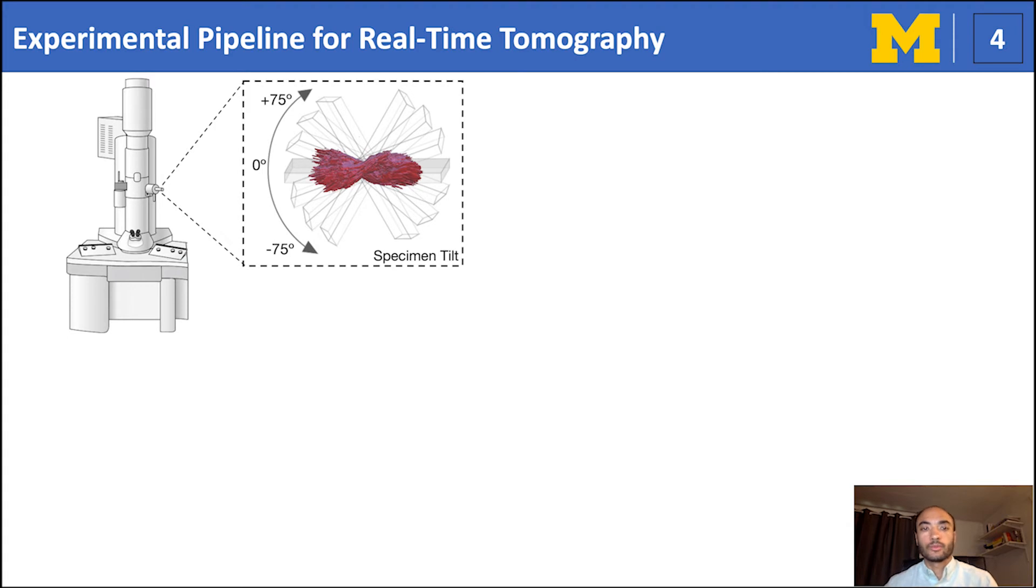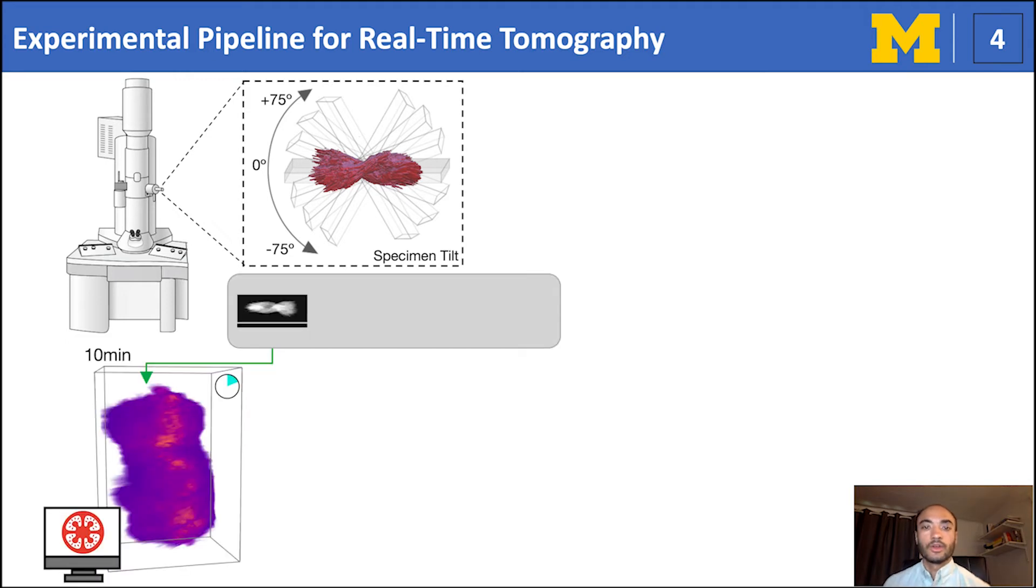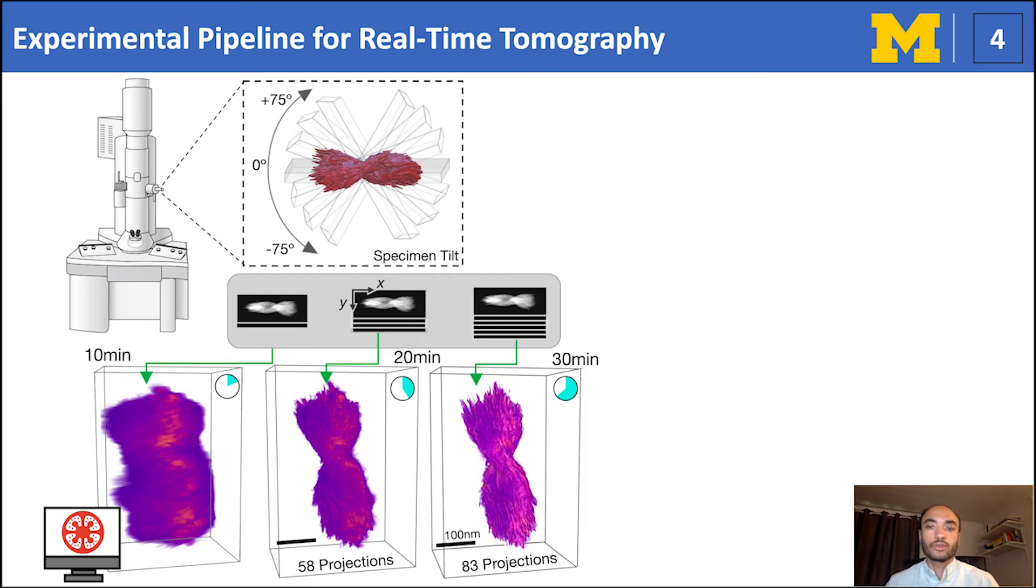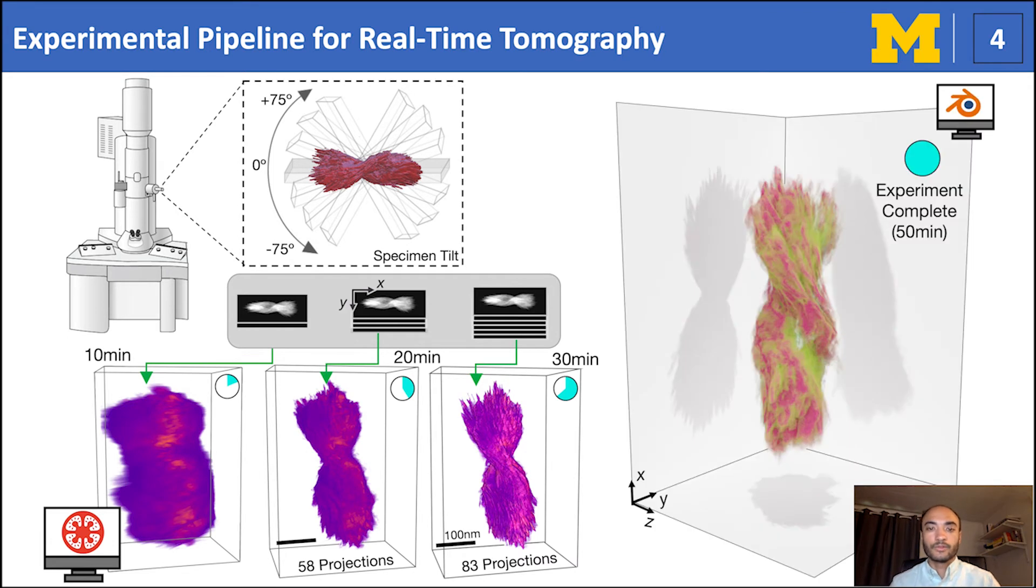Here, the real-time tomography workflow is demonstrated on a chiral cadmium cysteine nanoparticle which contains strong tunable chiral optical properties due to a twisted geometry. This real-time tomographic process runs simultaneously and continuously while the microscope is operated. New projection micrographs are automatically appended into the reconstruction process, and we see as more data is collected, the overall quality improves. At 20 minutes, or 40% completion, we can begin characterizing fine features, and a fully reconstructed tomogram is available as early as 30 minutes into the experiment. This means scientists can quickly investigate 3D nanostructure during imaging to guide experiments and redefine scientific objectives.